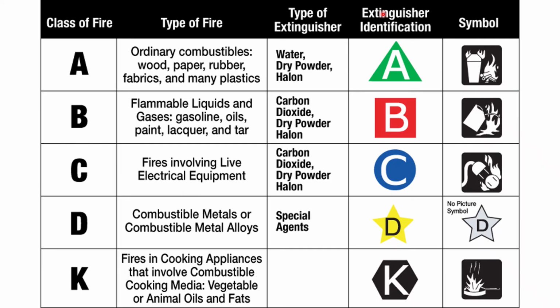Class D fires present special problems and extinguishment is left to trained firefighters using special dry chemical extinguishers. Generally, all that can be done for a Class D fire in the laboratory is to try to isolate the burning metal from combustible sources with sand or ceramic barrier material.